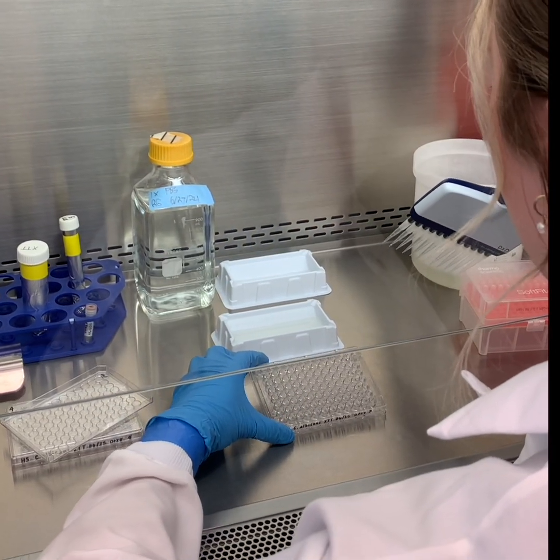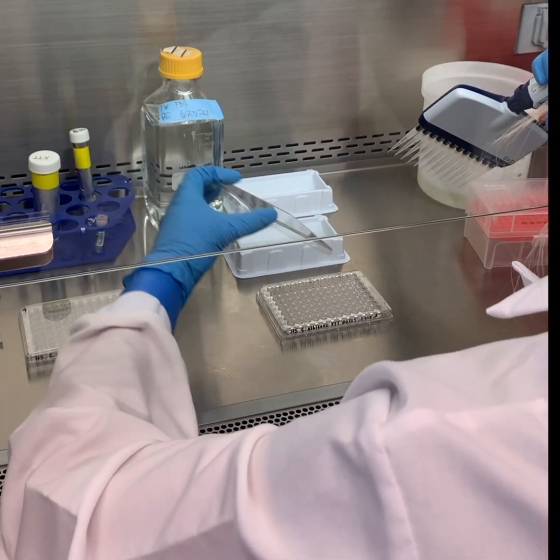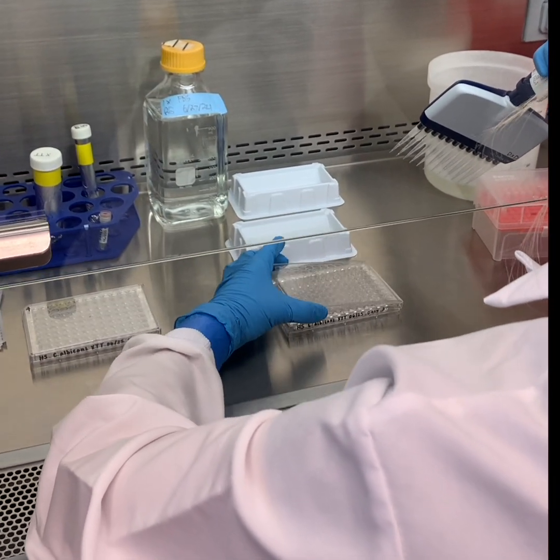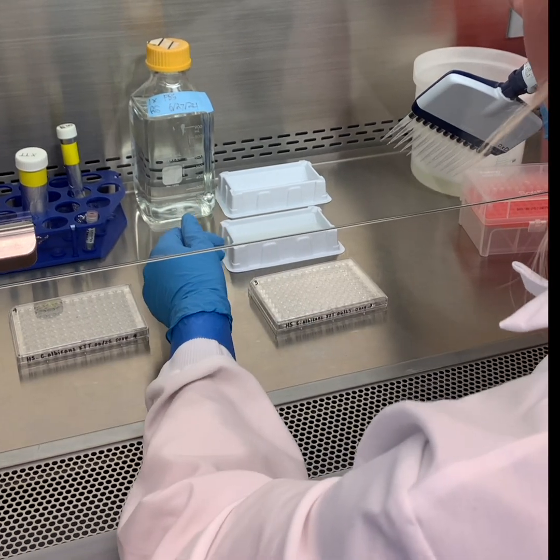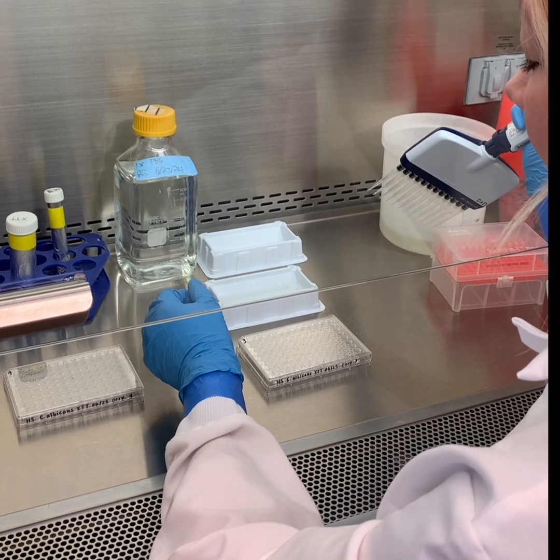Now that we've got it in all of our wells, I'm going to cover this plate and we're going to put it back in the incubator for 2 to 3 hours at 37 degrees, and then we'll take it back out and put it in our plate reader.